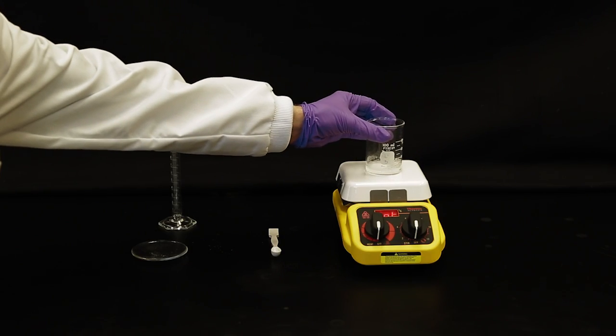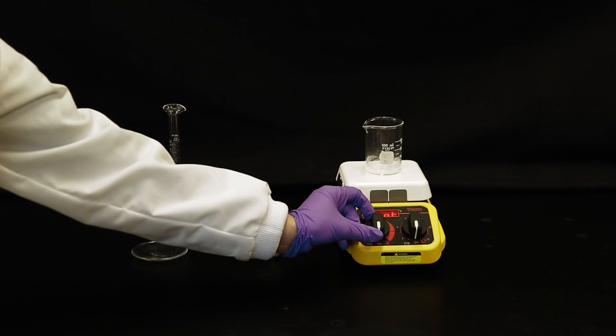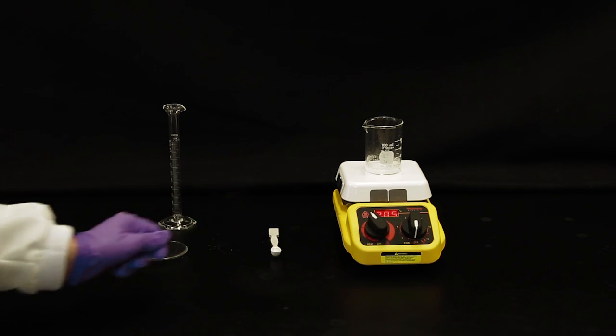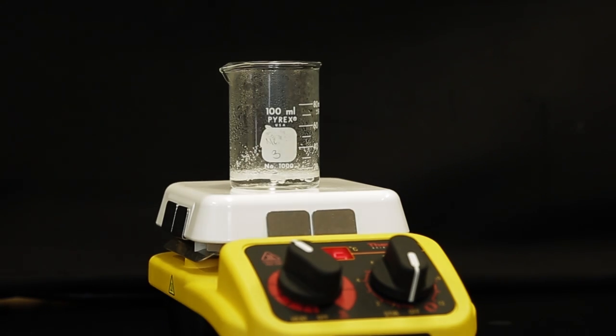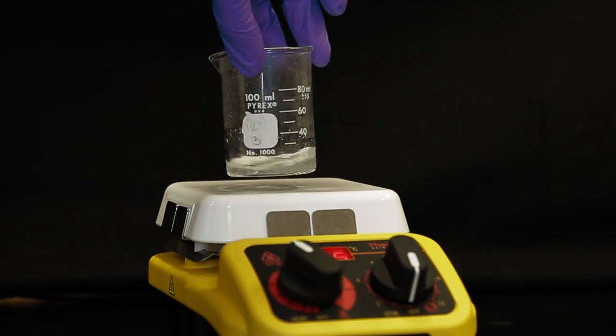Place the beaker on a hot plate. Heating the mixture until everything is dissolved ensures that the acetylsalicylic acid crystals release any trapped salicylamide into the solution.